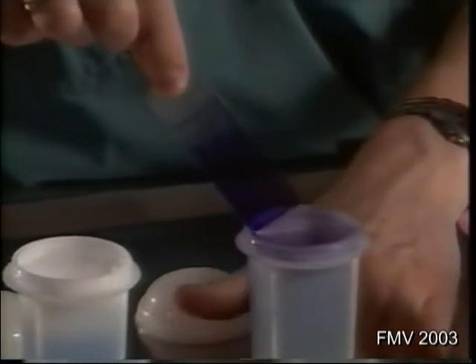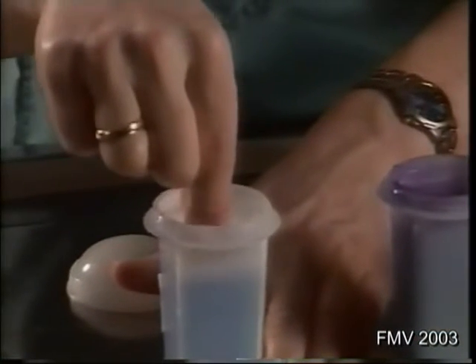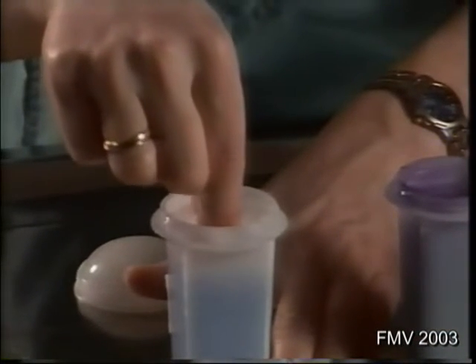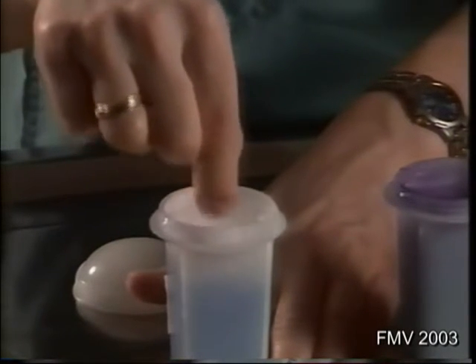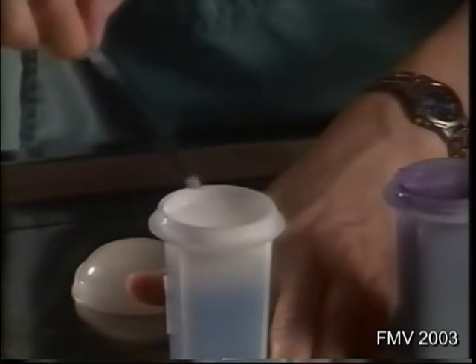Finally, rinse the slide in clean distilled water that has a neutral pH of 7.0. Allow excess water to run off the slide and allow it to air dry.